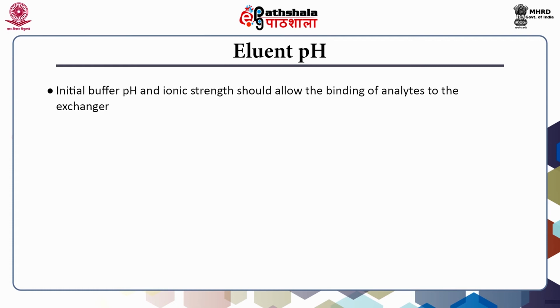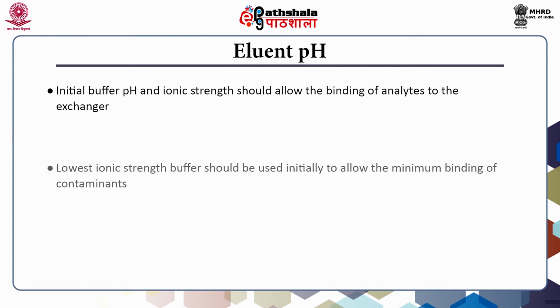There should not be low ionic strength or high ionic strength. There should be an optimum ionic strength. Especially, the lowest ionic strength buffer should be used initially to allow the minimum binding of the contaminants.